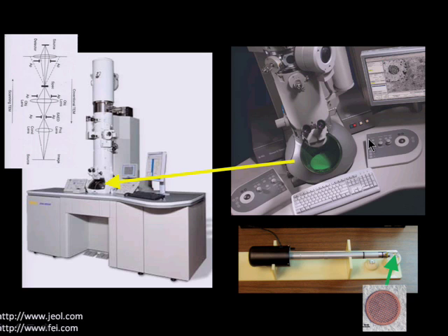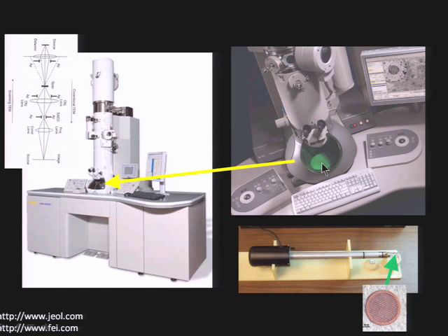And so here's a picture of a typical TEM. All TEMs generally have this kind of vertical column design like an SEM does. And this is just, I took the previous image and rotated it to give you the idea of how the electron beam passes through the specimen and how the CCD or the film detector is typically down here. And when you're operating one of these instruments, this is a picture of a different one, you can sit at the station, you can sit at the desk and you can see your image on the screen and you can drive it with the controls, but you can also operate in a mode where you actually look and you see the electron image of your structure on this phosphor screen, and then you can sort of take this screen away and you can let the image go down to the detector.